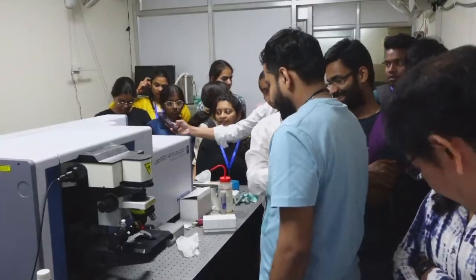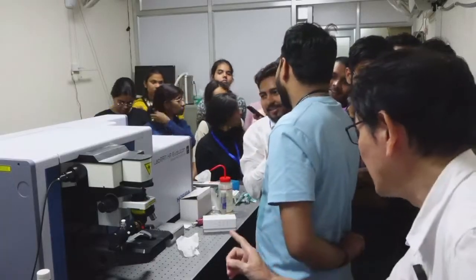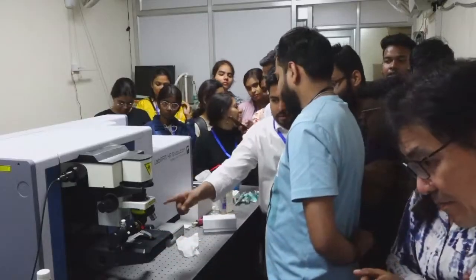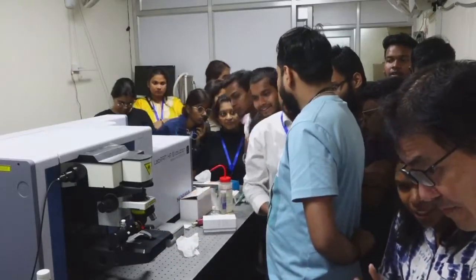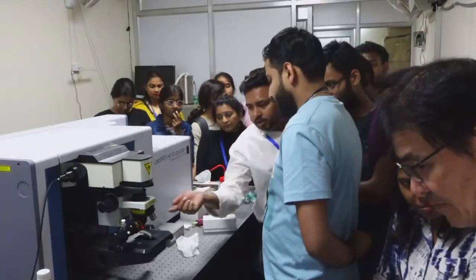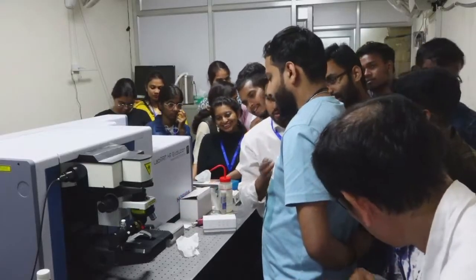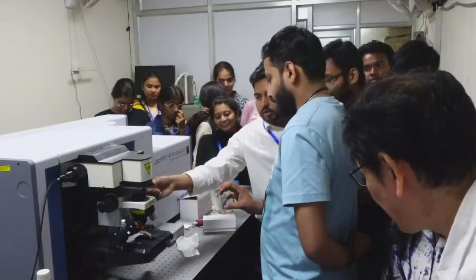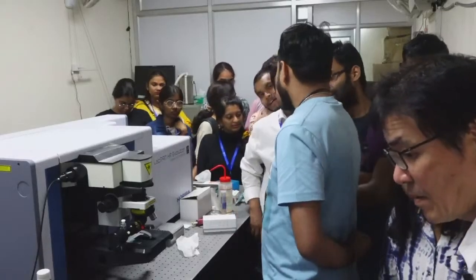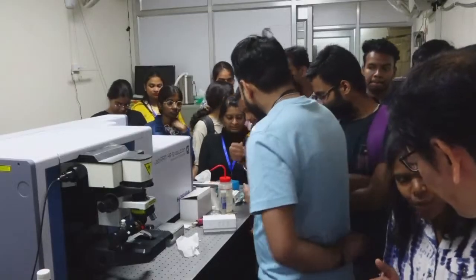Sir, how do we know the sample is well focused? In this case, focus on the chip. Here we can see the sample, the laser light is in focus. While doing a solid sample, if we use a glass slide, we have to focus the laser light into the sample. And from here we can also see whether the sample is focused or not.